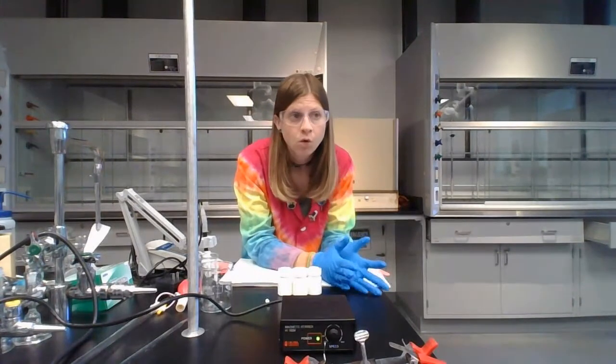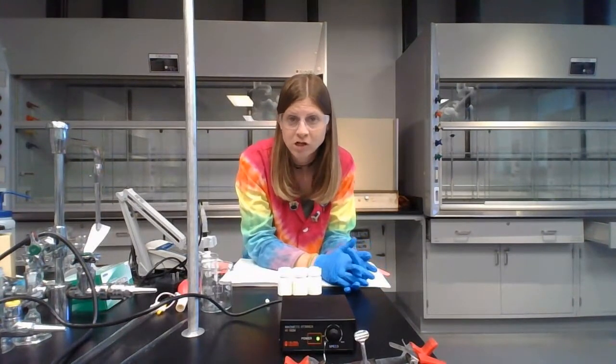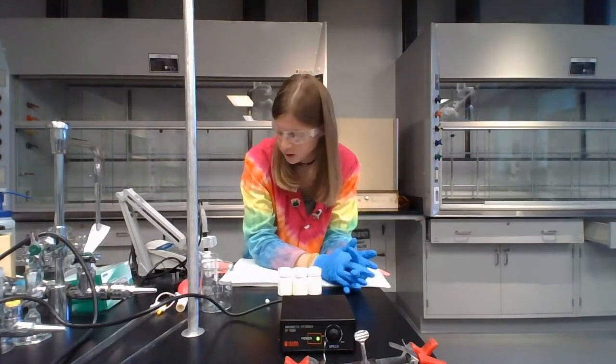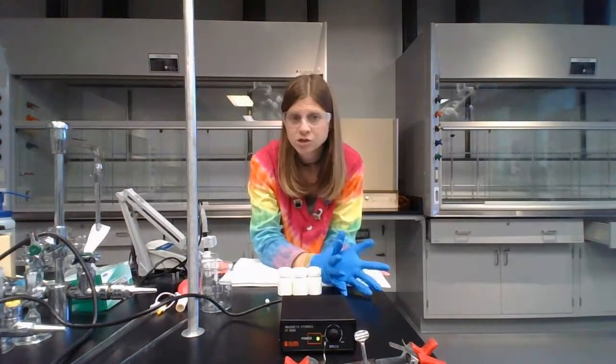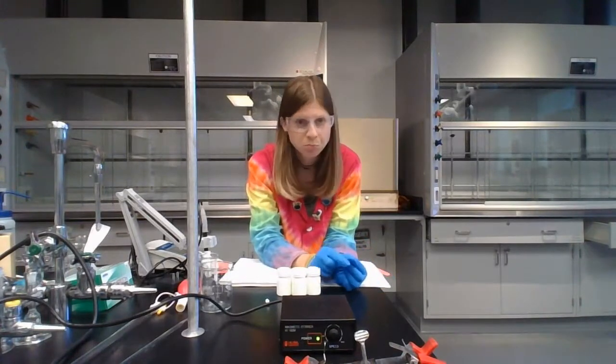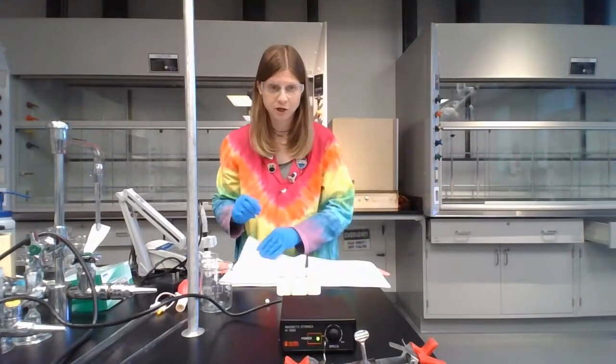Knowing that, when you get in the lab, your pH meter will have a set of instructions next to it, because we have multiple different brands and types of pH meters. So you will have to read the instructions once you get to the lab on the exact buttons to push for your version of the pH meter.